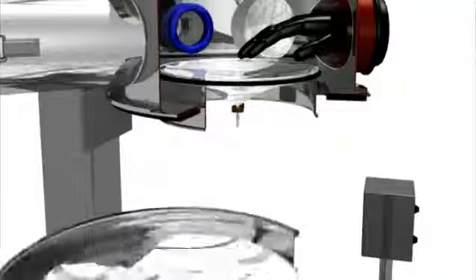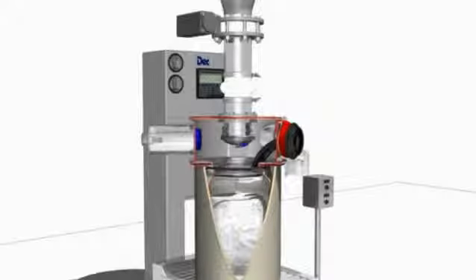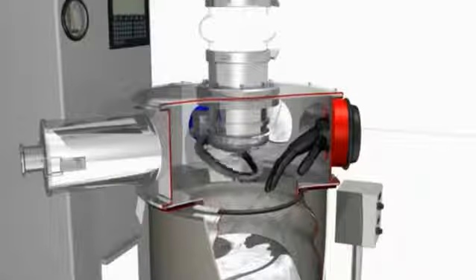However, this is not the end of the benefits of a DCS, as it can also be used as a filling system. Naturally, the system can fill into drums of all sizes by virtue of the variable height connection system.